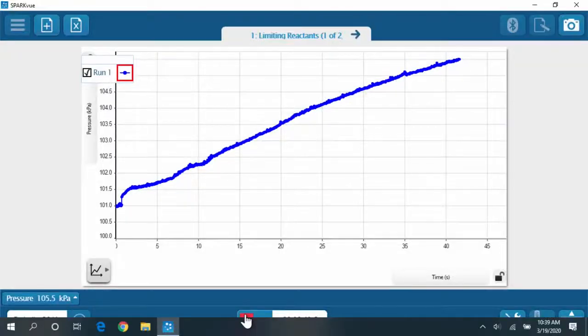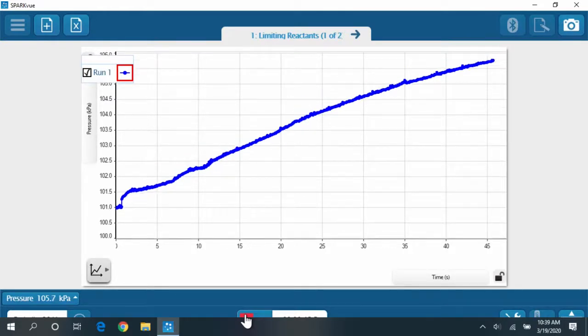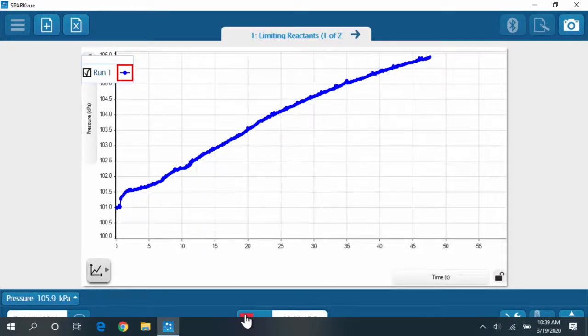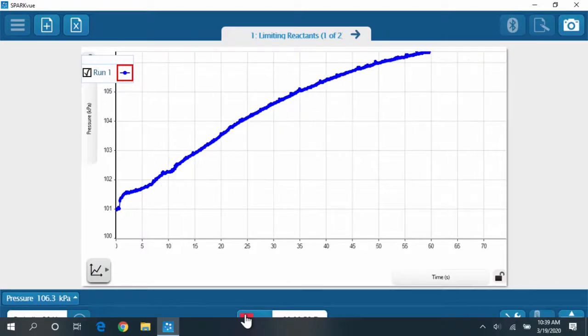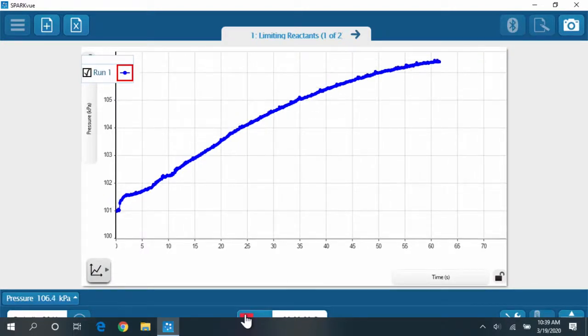Looks like it's starting to curve a little. It's beginning to slow down just a little bit. Nice. Yep, it's almost to flat. And I'm going to stop it right here. Excellent.